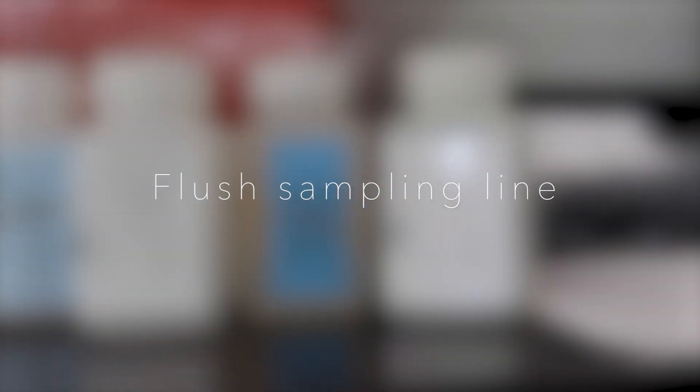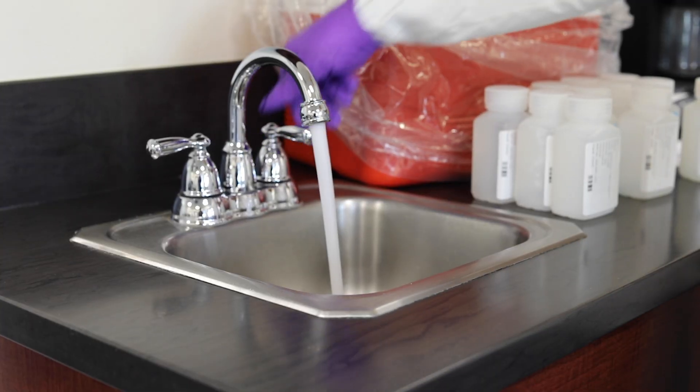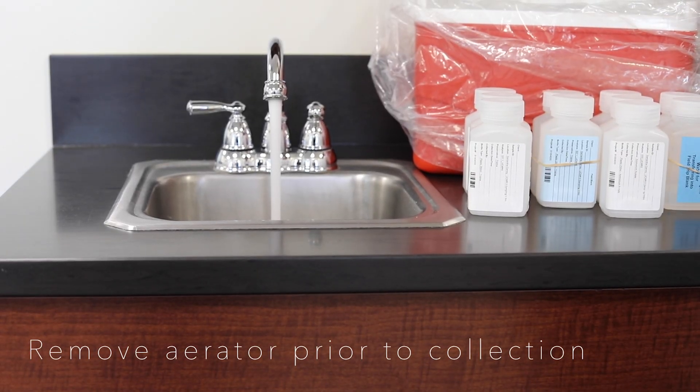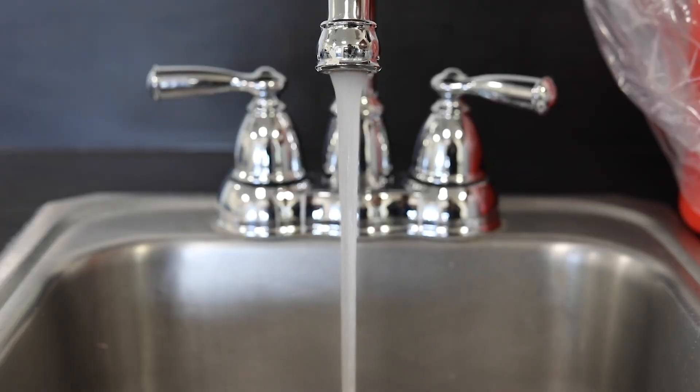Flush the cold water sampling line approximately 10 to 15 minutes prior to sampling. If your sampling point has a faucet with an aerator, it is recommended that the aerator be removed prior to collection. Be sure to slow the water stream before collection.